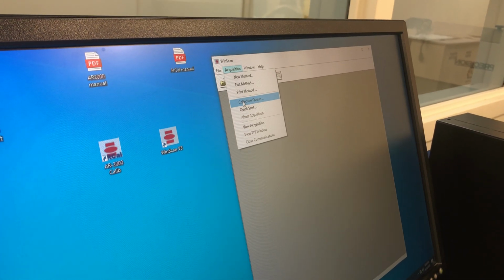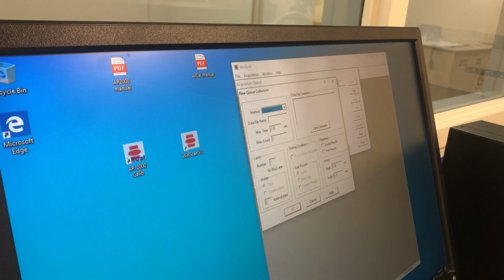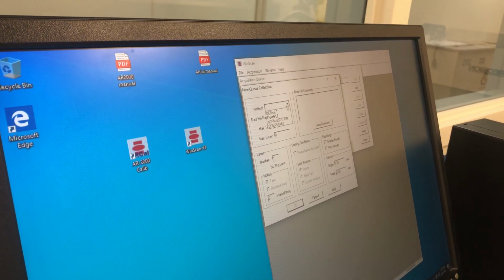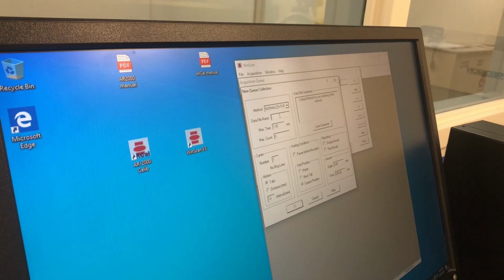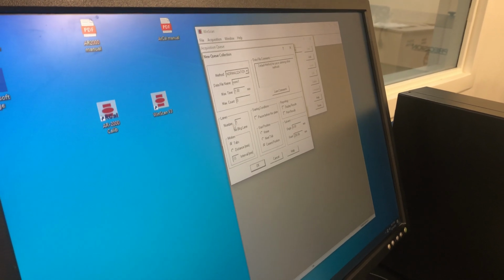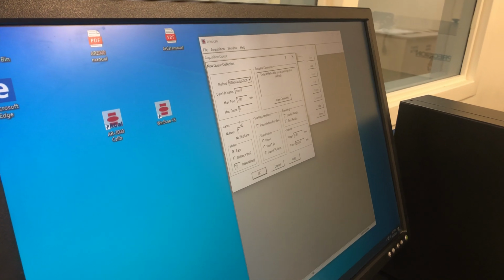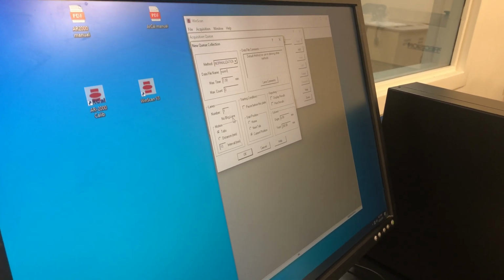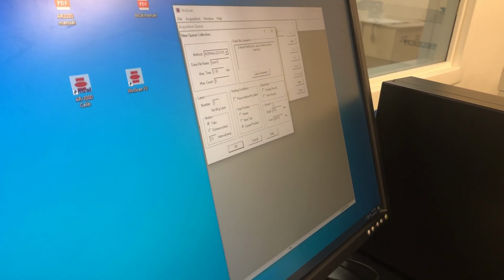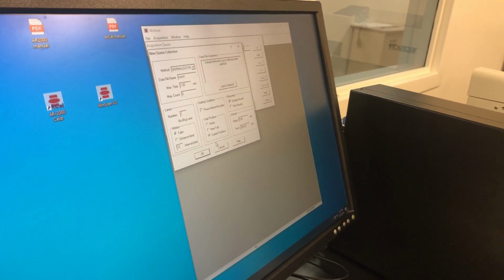You go to the collection queue, okay? And then you add, and you pick out what method you want. We want the normalization method, and then you put in a name. And we'll call it norm1. 1 minute. You can change some of the parameters at runtime, such as the maximum time, those sorts of things, the number of lanes, the current position. You can change these and have the display results there checked.